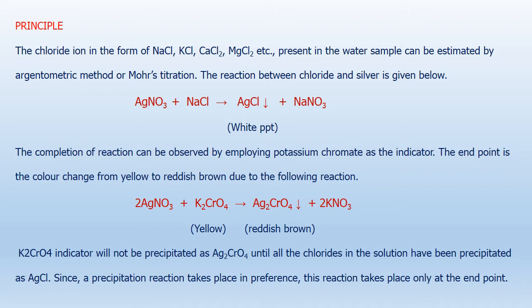If you get a reddish brown tinge in the white precipitate, that is the endpoint. If you continue titrating, more and more silver chromate will form and it will turn dark reddish brown — that is not the endpoint. Just one or two molecules of chromate should react with silver nitrate to give the reddish brown tinge — that is your endpoint.